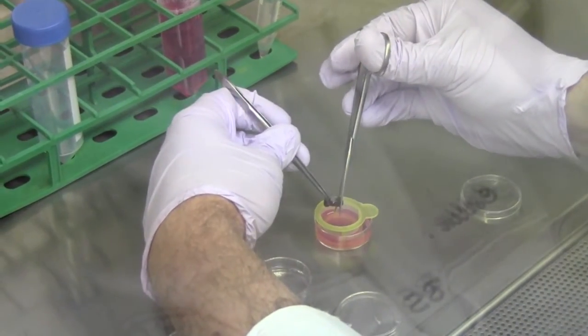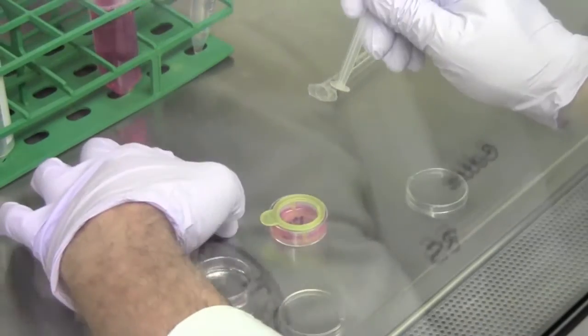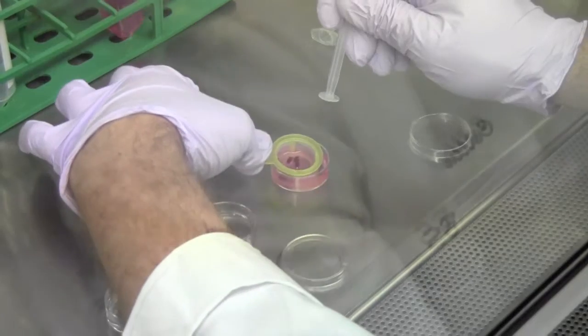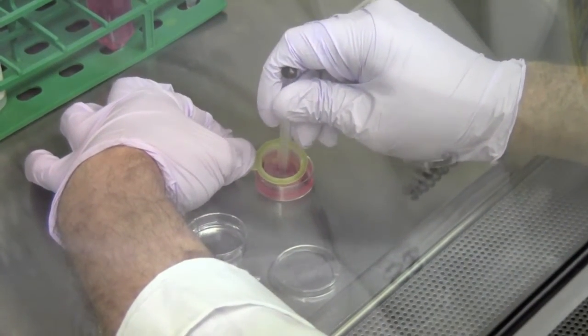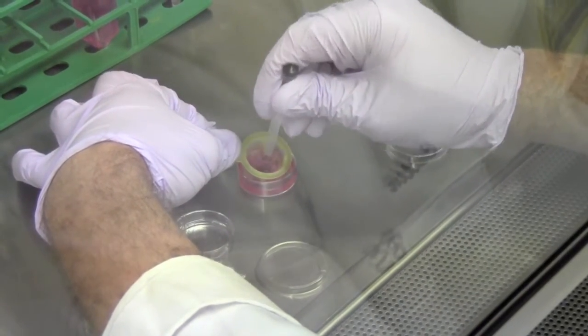Next, the spleen is cut into small pieces using scissors into a cell strainer. The back of the syringe is used to smash the spleen and pass the cells through the cell strainer into the complete medium, creating a single cell suspension.